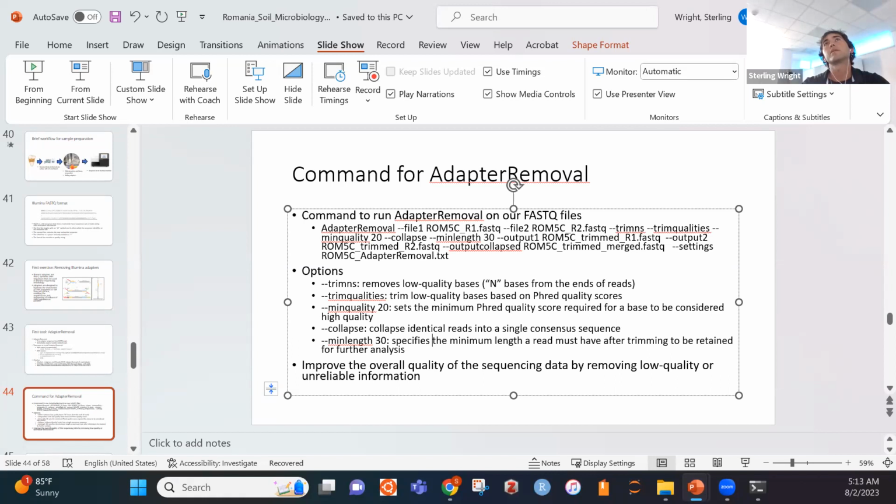And then lastly, we can set the minlength. I set mine at 30, which for ancient DNA is, I would say, conservative, because people go all the way down to 25 and accept short fragment lengths. There's a trade-off here, and I wouldn't say there's one optimum answer. This is for ancient DNA, but it can also be applied to other sample studies.